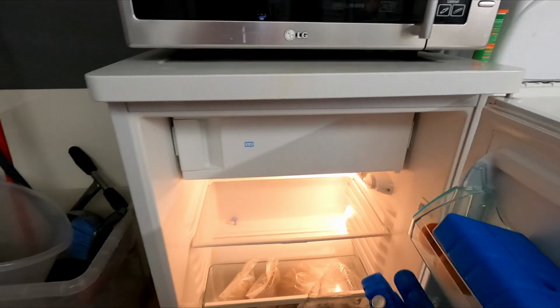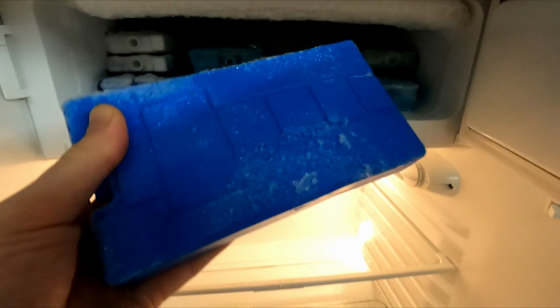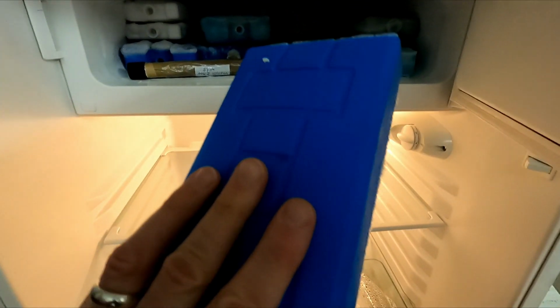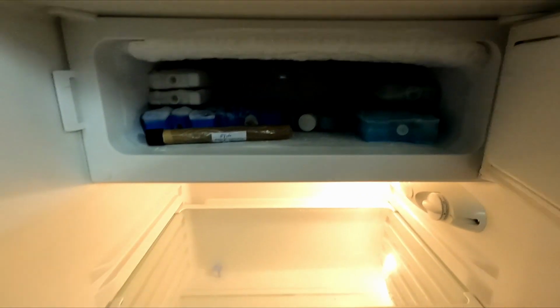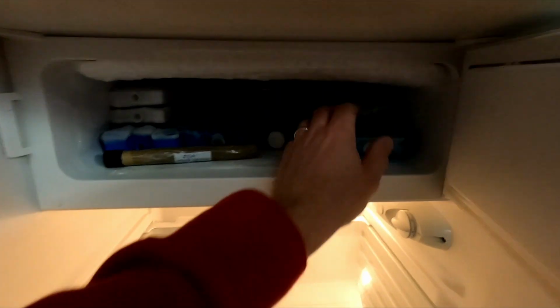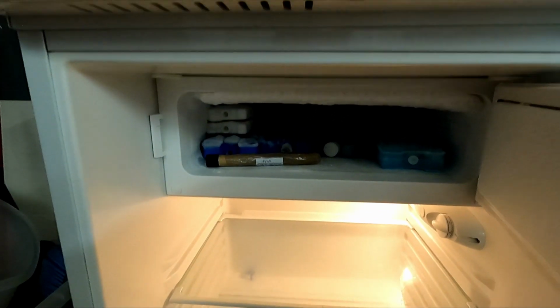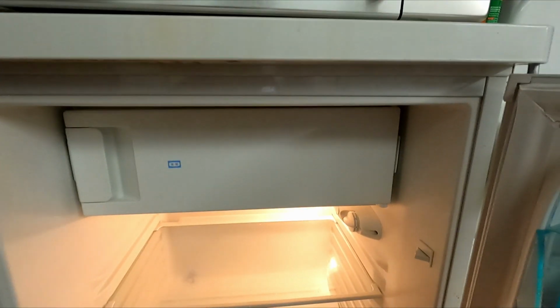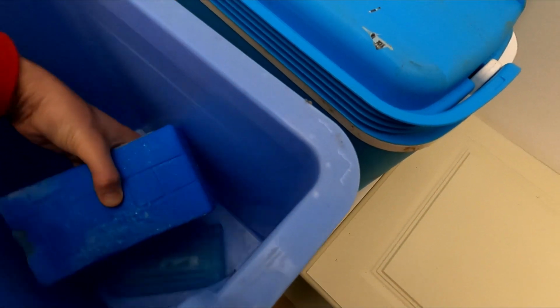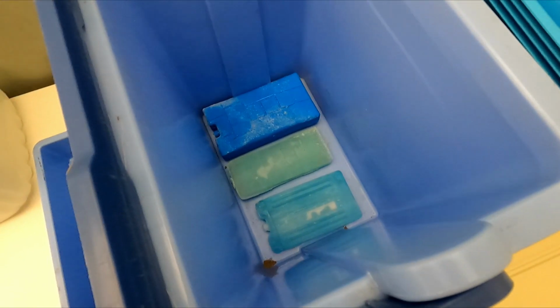Now, the next item that I use in this combination are these cool packs or freezer packs. We tend to save the ones that we get sent in to us, and we put them in the fridge like this, and we can draw from them whenever we want. I tend to find 3 is about the right number. Once I've done that, super straightforward. We're just going to line them in the bottom like so.